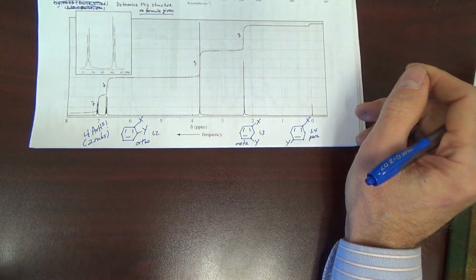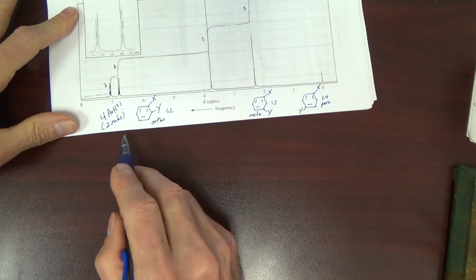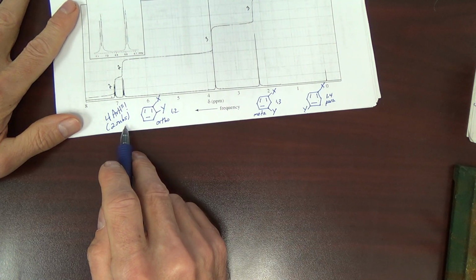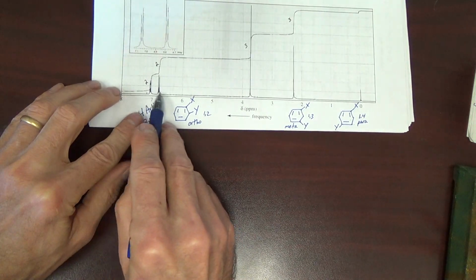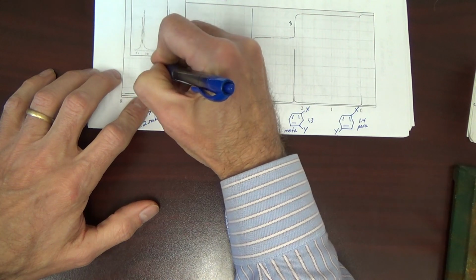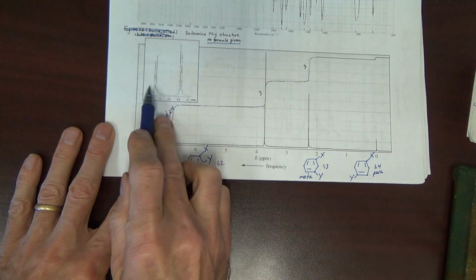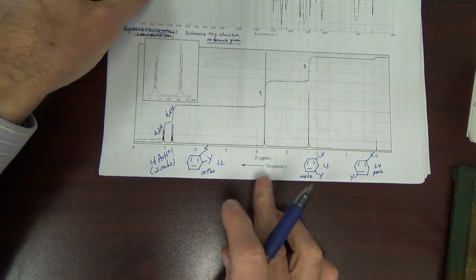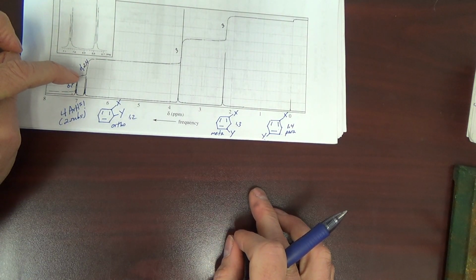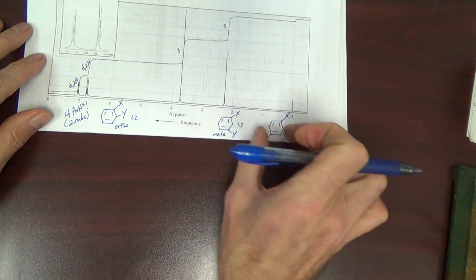And this is very important for understanding number of signals, and here we want to look at the splitting as well. This is doublet 2H and doublet 2H. It's 2 doublets. They've expanded it here for you to see it a little bit better. Doublet 2H, doublet 2H. And this clearly comes from the splitting.